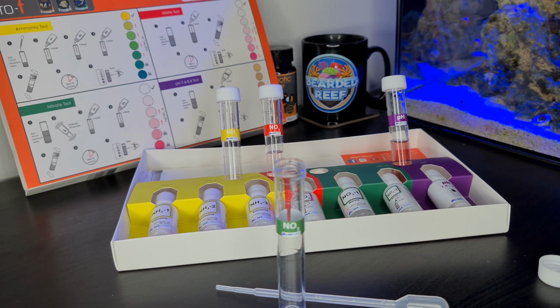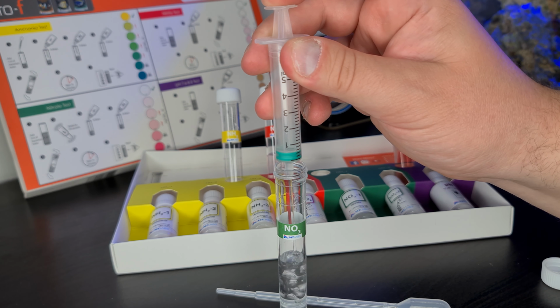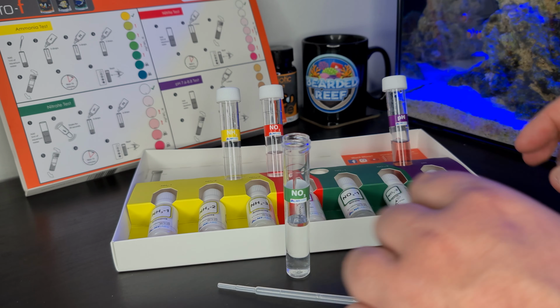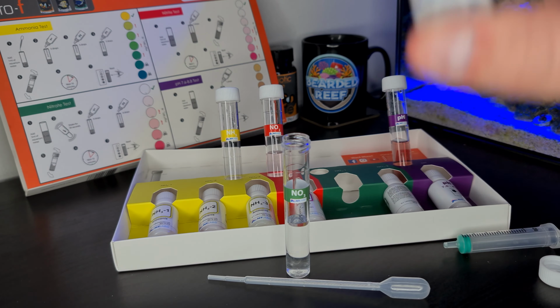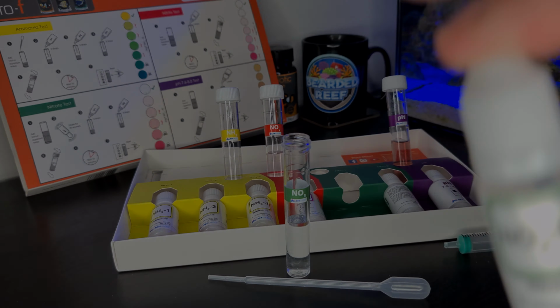Quite like the kit so far anyway, just to see how we got on with it. So the nitrate test, 5 mL of water again. There's 5 mL of water in there. And then it says shake bottle 1 for 30 seconds. So I'll shake this for 30 seconds. I'll save you guys the pleasure though, you won't have to watch this, I'll skip this bit.